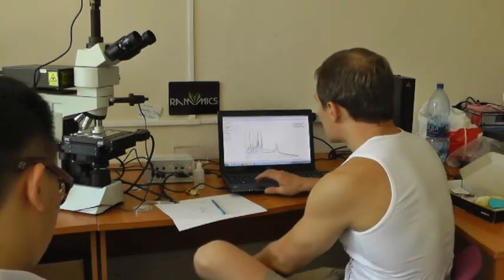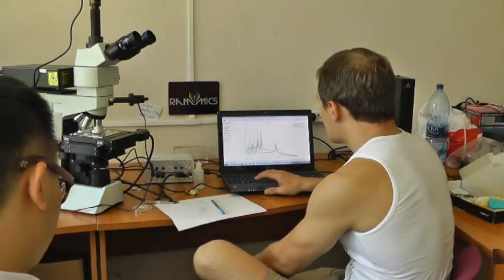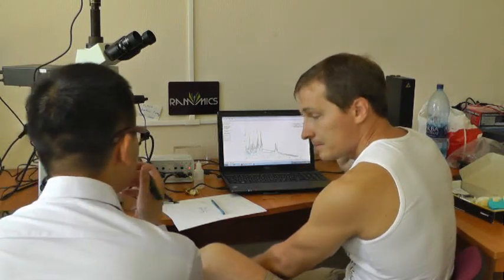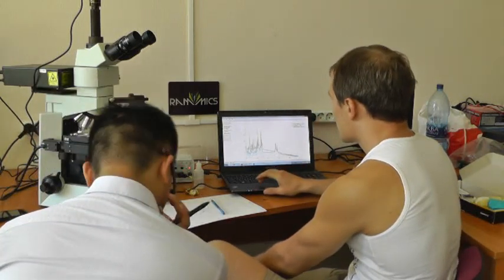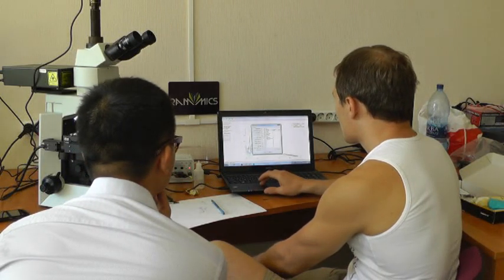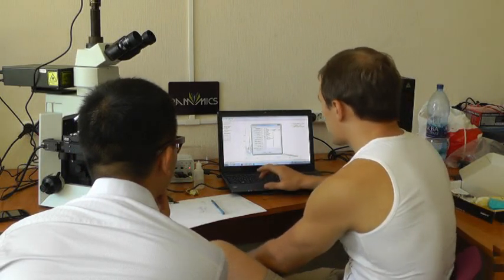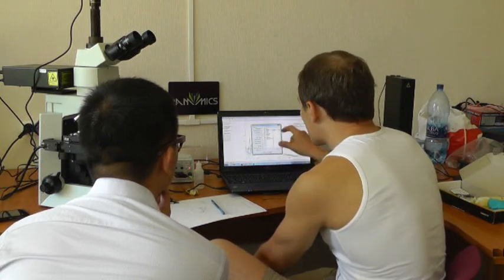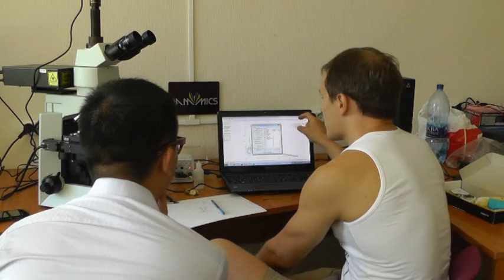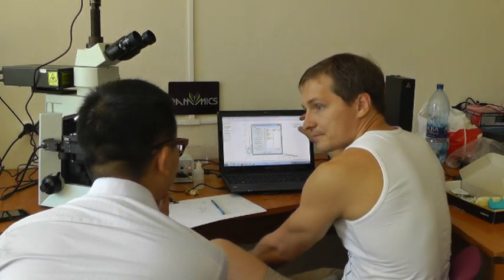Another question is about the search group you mentioned. This parameter, if I set it to 5, what would the value do? If you set it to 5, you will have an overall number of substances less than or equal to 5.